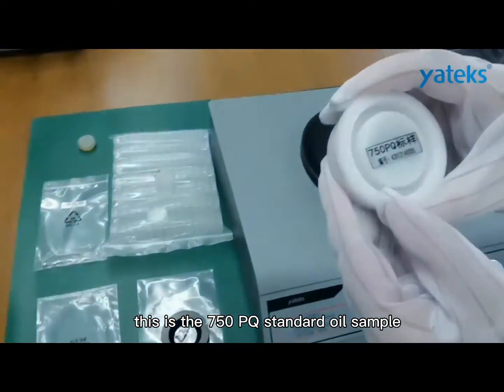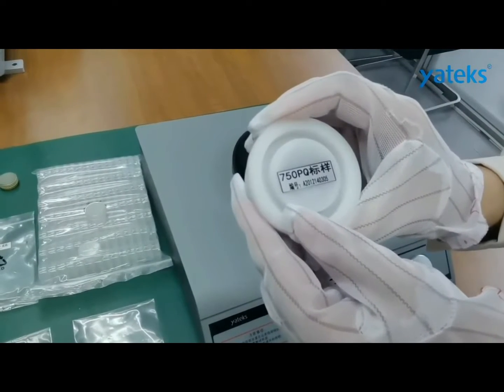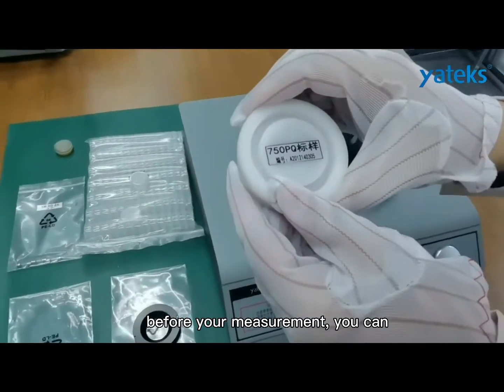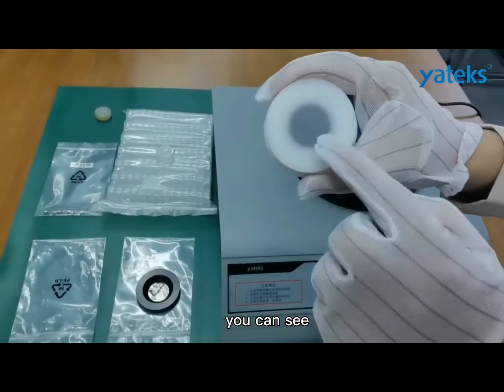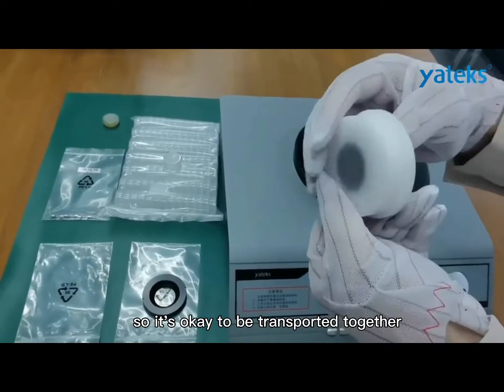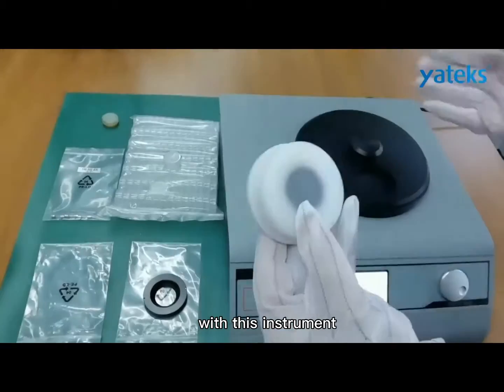This is the 750pq standard oil sample. It is mainly for calibration purposes. Before your measurement, you can do the calibration first. You can see it is solid here, not liquid. So it is okay to be transported together with this instrument.